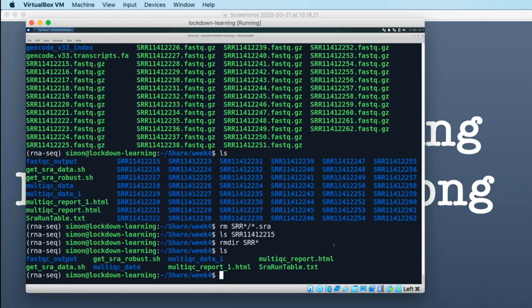It's always important to think about these things, and we didn't need those. We didn't need those files hanging around. And as I said, we can always re-download them.